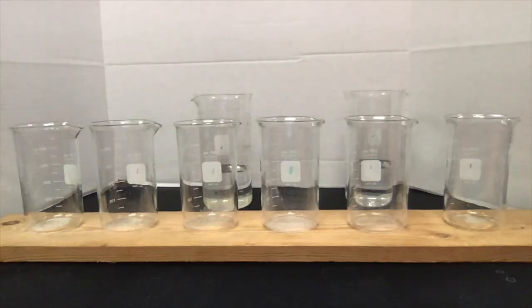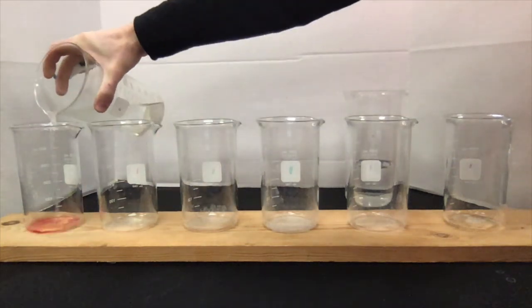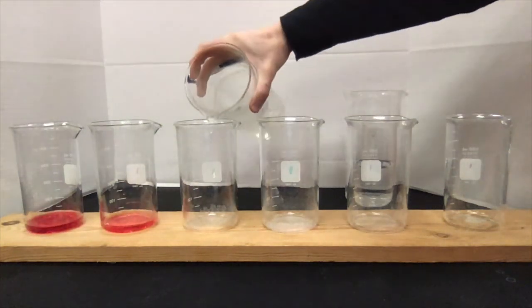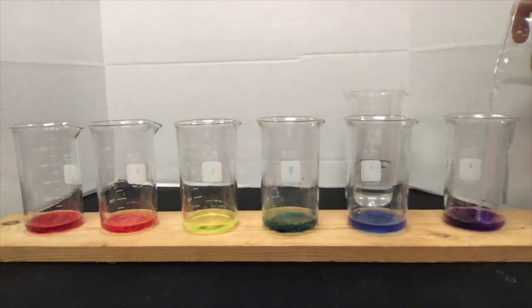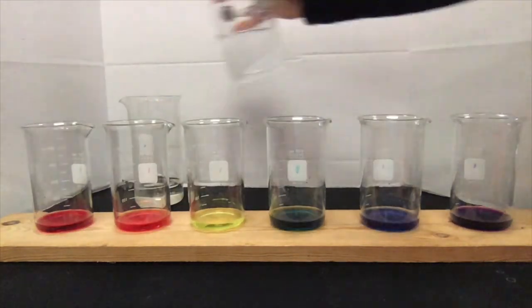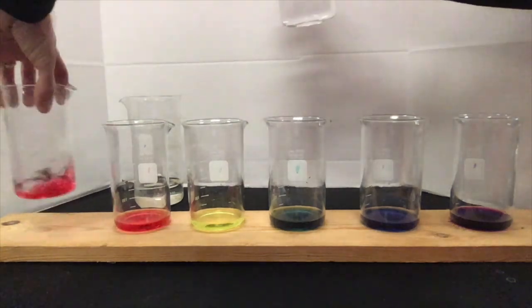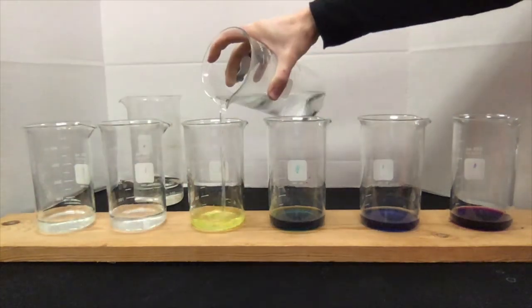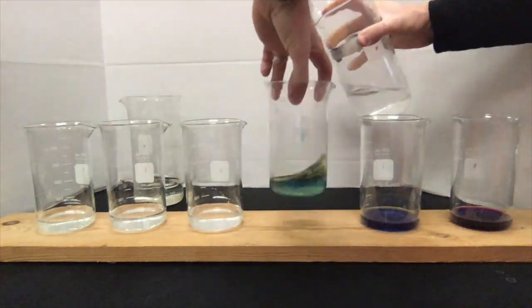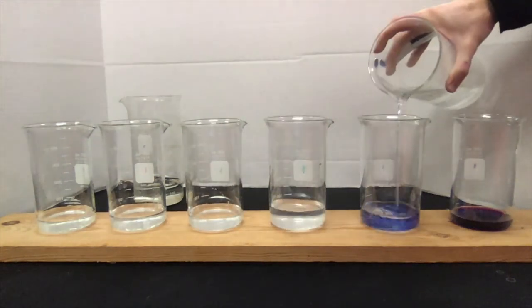Knowing that some substances are acids, while others are bases, and that indicators turn different colors when in contact with an acid or a base, I wonder if you can explain the demonstration you saw at the beginning of this video. Those liquids are probably not water. You think it's possible there was something in the beaker before the demonstration started? Also knowing that an acid can cancel out a base and leave the substance neutral, can you also figure out how all the colors disappeared in the second part of the video?